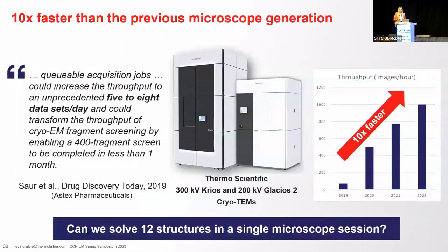So with this huge increase in speed and automation, we were curious what possibilities this would open for us, especially in the background of drug development. And so the question we asked ourselves, can we solve 12 structures in a single microscope session?